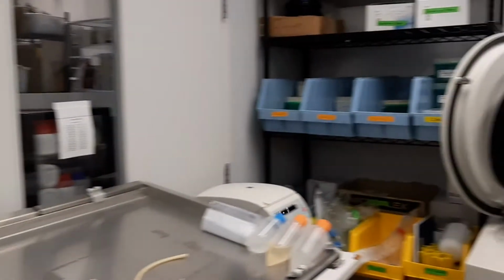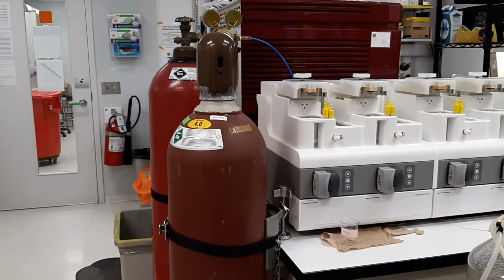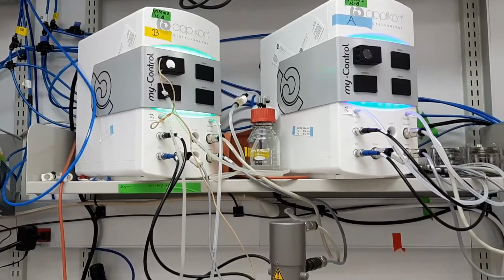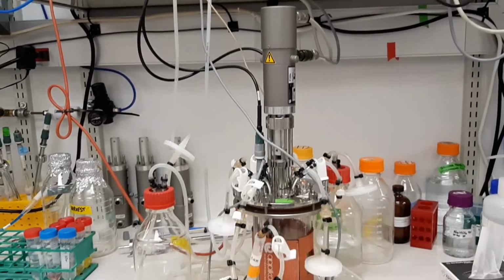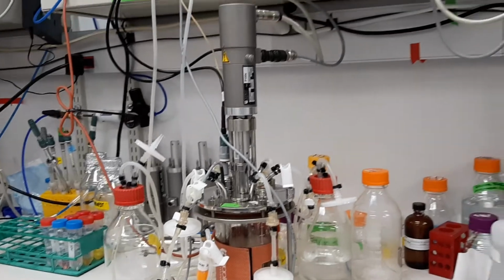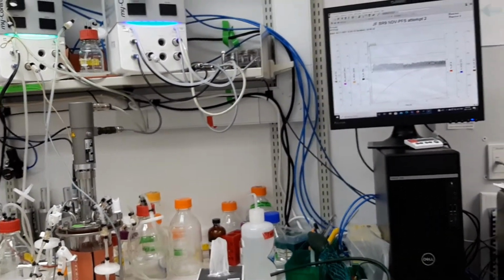The lab is equipped with a variety of equipment and resources that enable us to develop novel cell lines and manufacturing processes for the production, purification, and characterization of viral vectors and vaccines. The Applikon bioreactors and control units enable us to operate bioreactors of different capacities, up to 3 liters. These are suitable to generate enough material for small-scale applications and modify conditions for scaling up purposes.